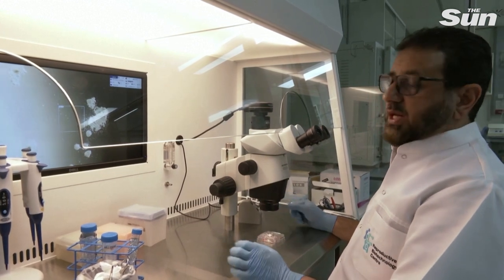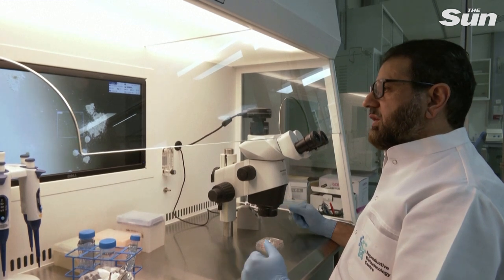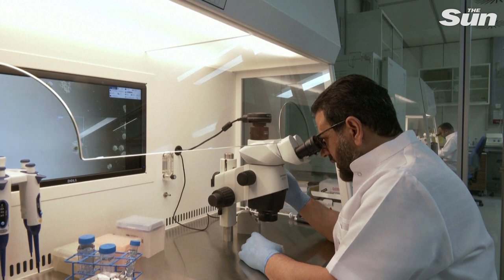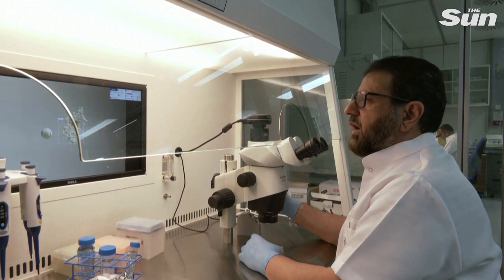Before they reach the stage where we can use them for the cloning process and before they are ready for the process. So these are the ones which have been, for example, cultured for 24 hours, and we are now checking them whether they have matured or not.